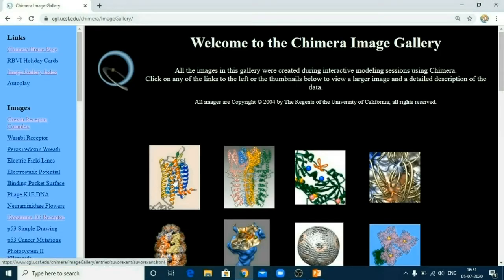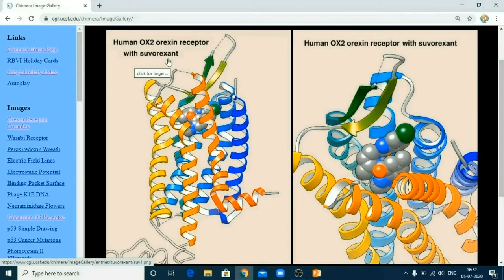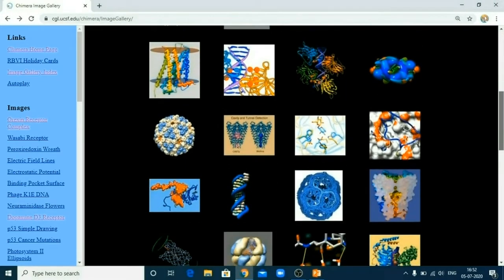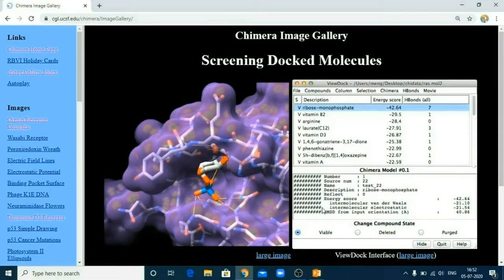Let us move to this image gallery to see what kind of images are possible. Now you can see this is a structure of a protein — OX2 Orexin receptor with suvorexant. Such quality images can be generated using UCSF Chimera. As belonging to the pharmaceutical chemistry field, I am more interested in docking visualization. Such docking visualization images can also be generated. The stick is representing your ligand and it is embedded in the pocket of the receptor, which may be a protein like an enzyme or a receptor. This table is showing you how the docking scores have been generated. So both purposes can be done by using UCSF Chimera.